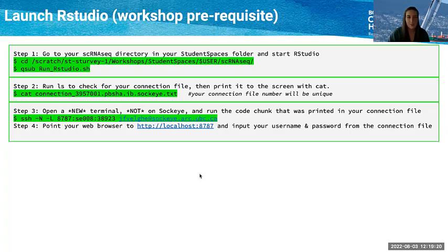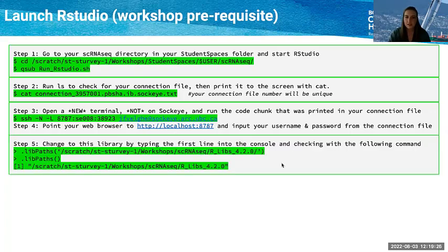And then point your browser to this address here. I'm going to give you guys a minute to do that. People in person, how are we doing? Good, you're there. Okay. All right, Zoom, can you give me a thumbs up once you get RStudio launched?